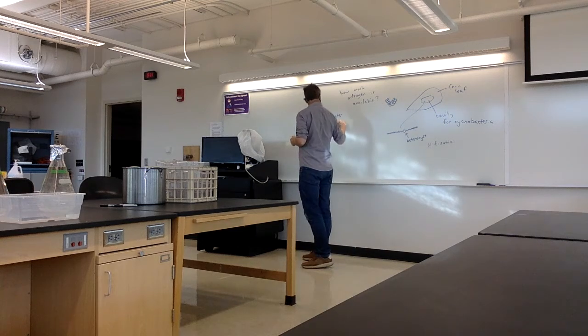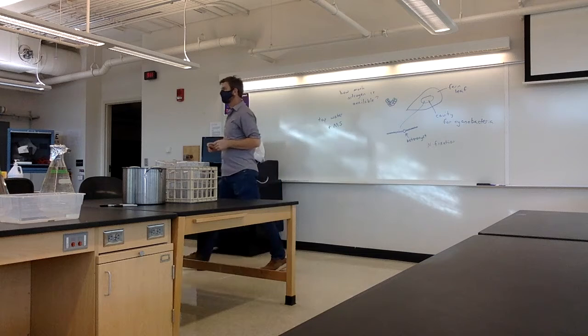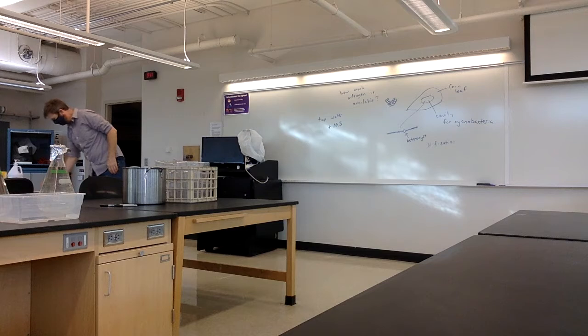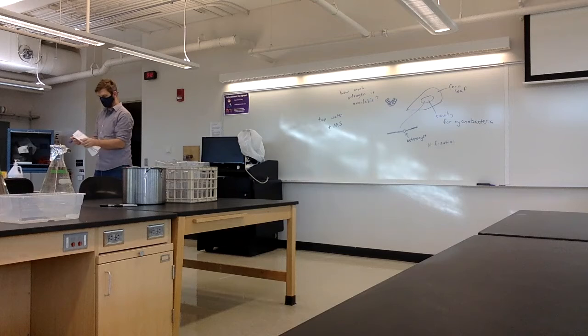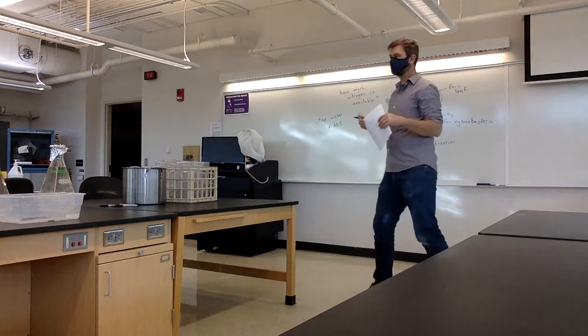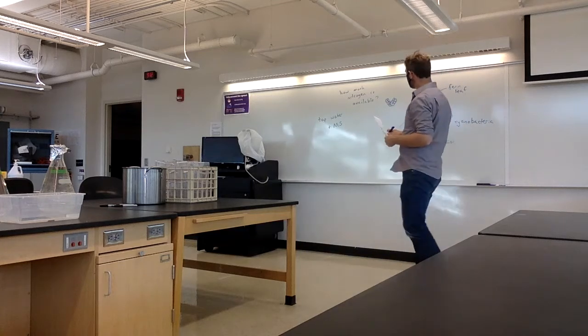So there's one that I'm abbreviating MS. So on page 2, I mentioned the ingredients we have. I've got 4 flasks here, each with a different kind of water.